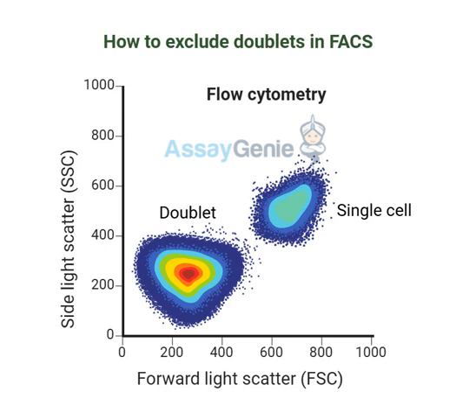Exactly. And if the cells are labeled with these fluorescent markers. Oh, right. You mentioned fluorescence earlier. Now you have to tell me more. We're talking like glowing cells here. We are. Scientists can tag different types of cells with special markers that glow when they're hit by the laser, kind of like a color code. Oh, that's cool. So each cell type gets its own color.